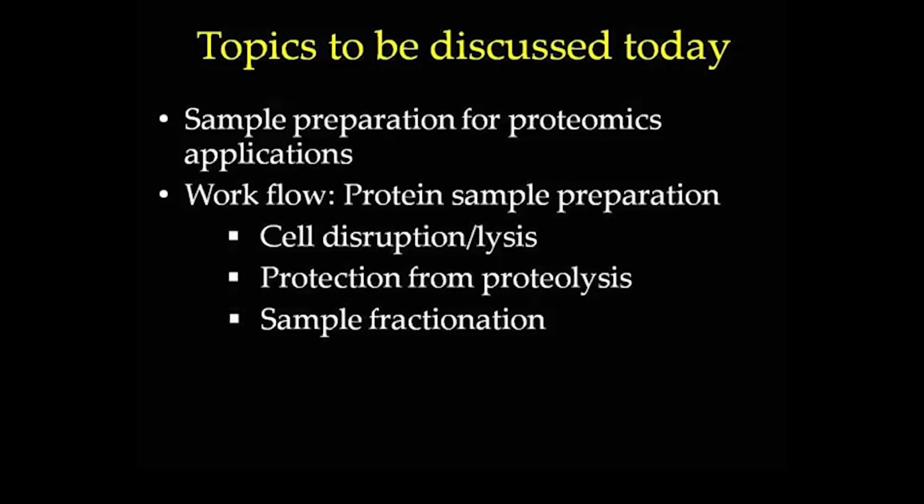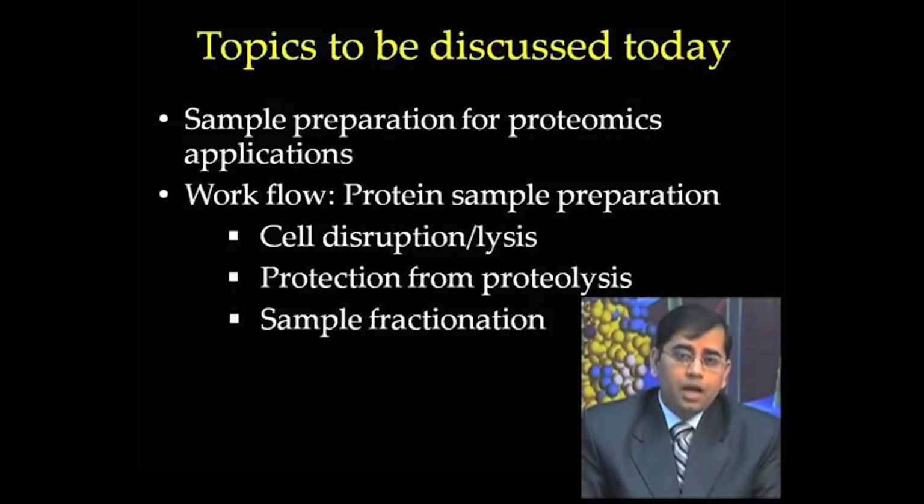I will give you a workflow for protein sample preparation, such as the first step, how to disrupt the cell, how to lyse them, how to protect the cells during the lysis step, so that there is no proteolysis occurring, how to fractionate the samples.